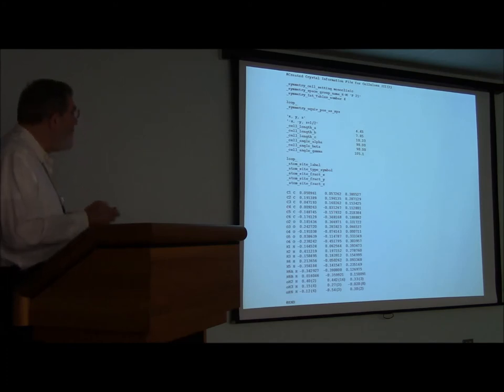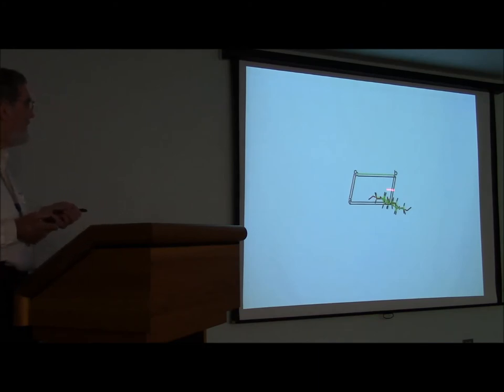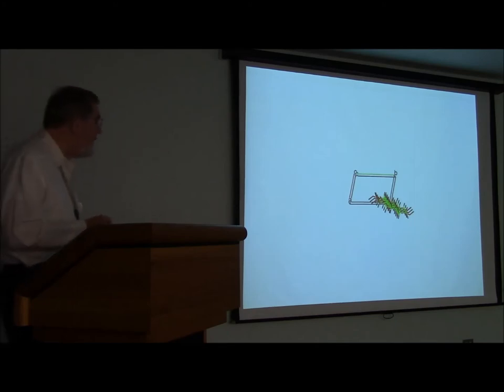And what I'm going to show you is, well, first, here's that cellulose 3 unit cell as depicted in the computer program Mercury. That's a free download. Here's one cellobiose unit in the unit cell, and we can extend that chain to make the chain longer. So this is more or less coming out of the screen at you here.